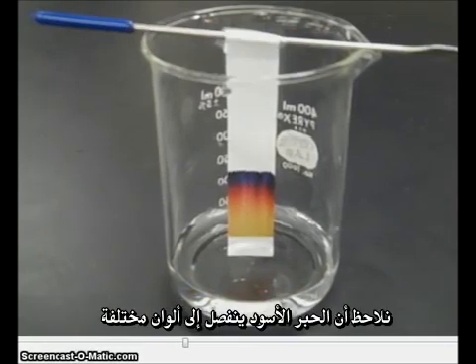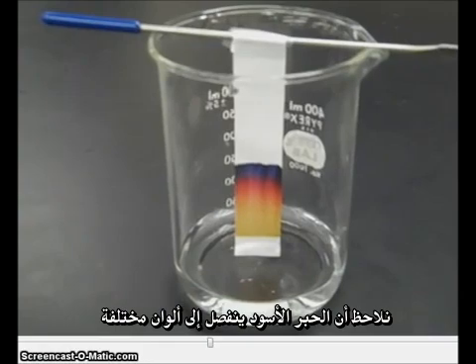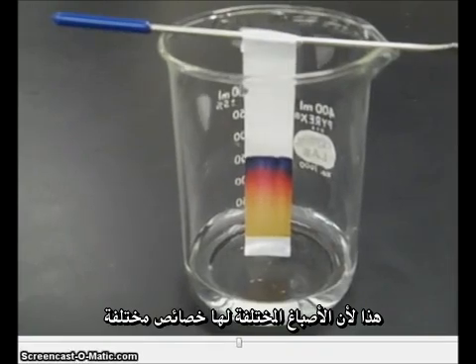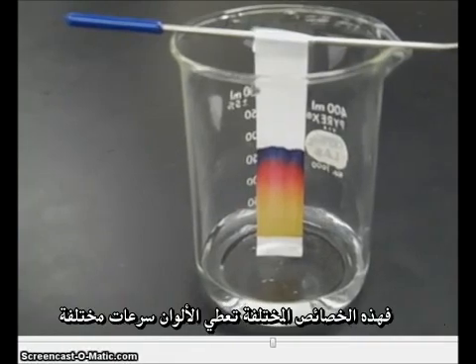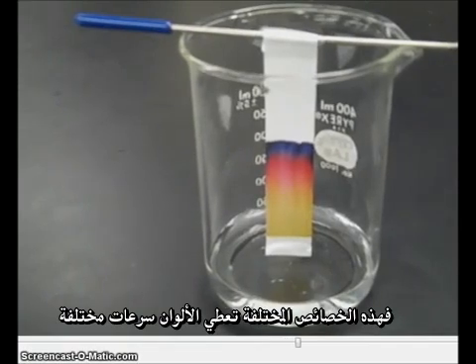We can see that the ink, which originally looked black, is starting to separate into different colors. This is because the different pigments have different properties — some of them are heavier, some are lighter, some are more soluble in water, some are less. Because of these differing properties, all of the different colors are going to travel at different speeds.